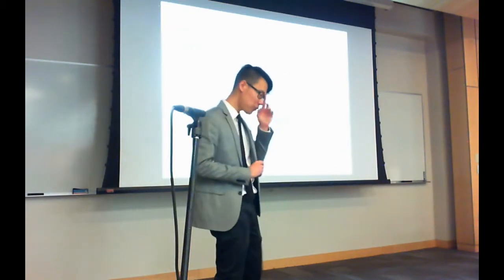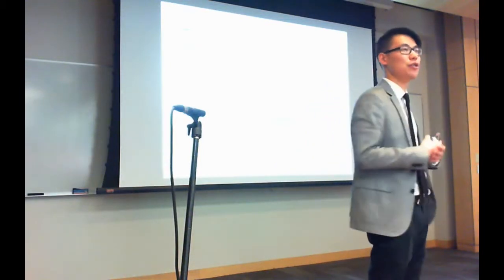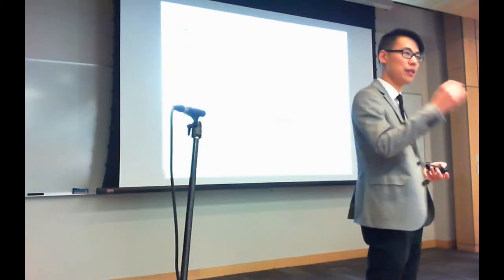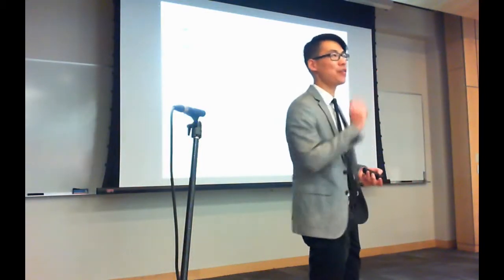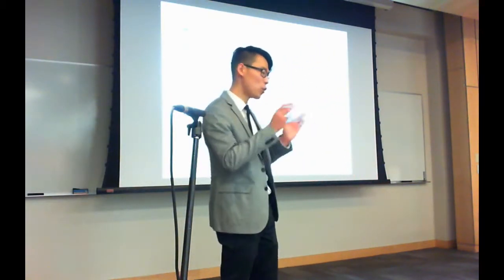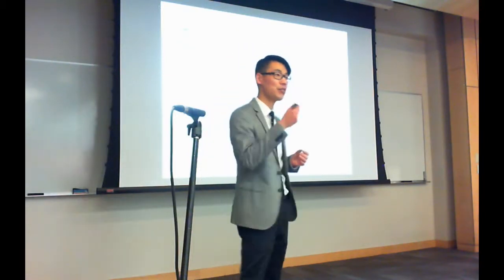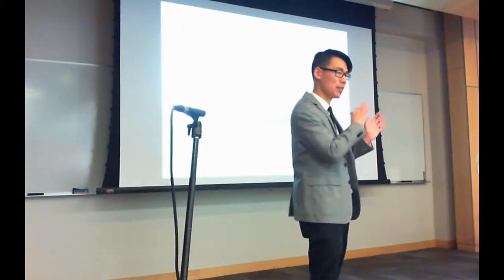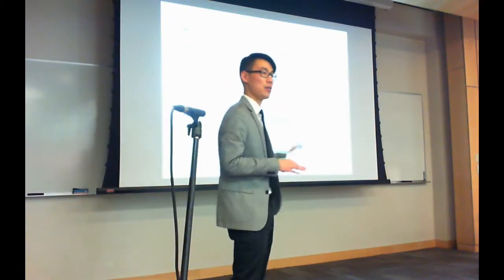And so we take this data, we identify with a database search engine, we cut at an appropriate FDR value for identifications, and we look at concordance between these light and heavy pairs. If you find that the light and heavy pair have the same identification, and the specific spectra also have high similarity in fragmentation, we believe that will reduce a lot of the error in this particular library.